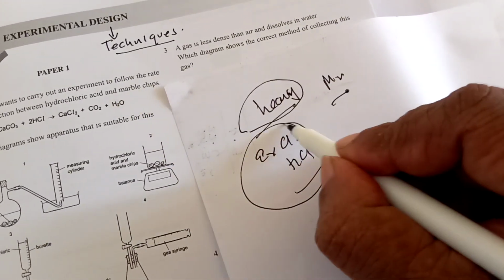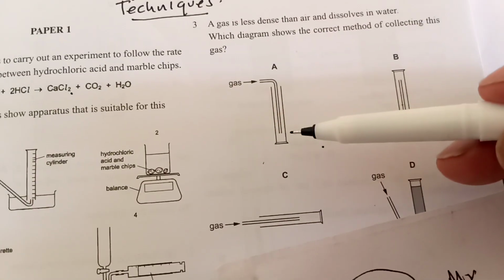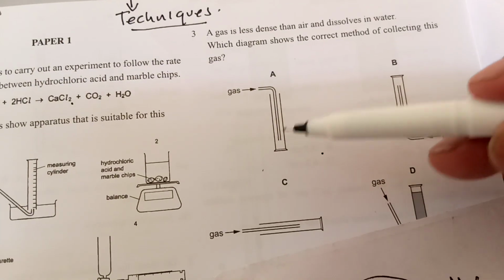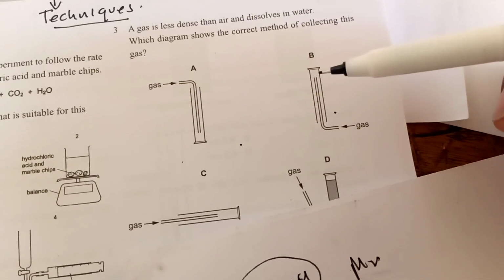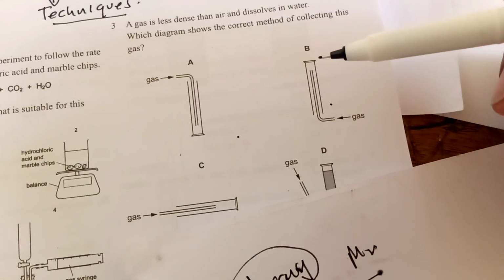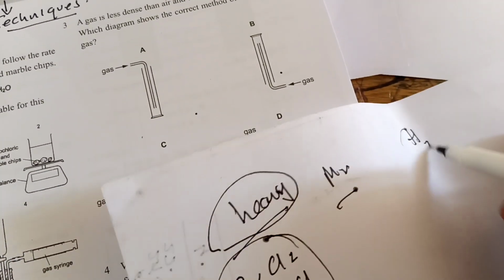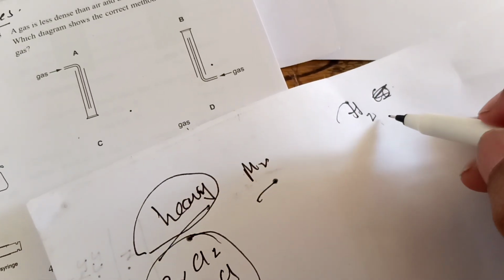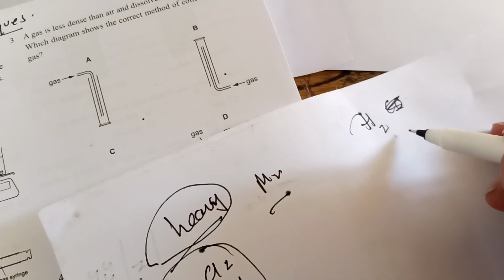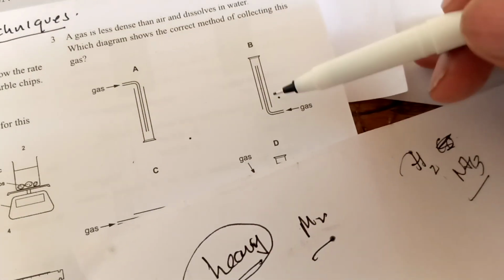These are heavy gases. The gas will displace air, air will flow out, and it will be filled with the gas. This method is used to collect a gas which is less dense than air. For example, hydrogen, or if you want ammonia, these are light gases. They are lighter than air.